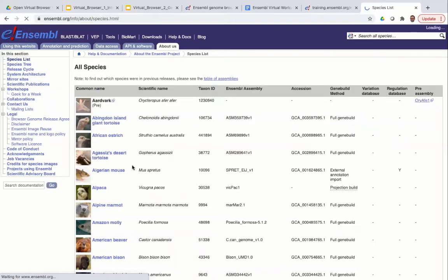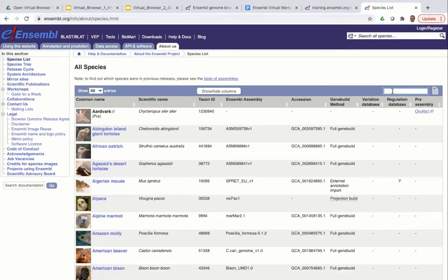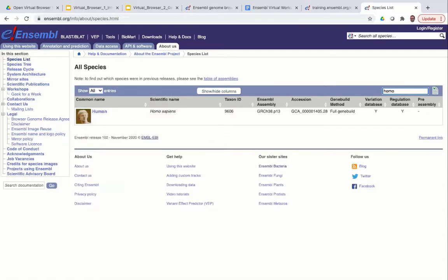This takes you to a table with information about all species in Ensembl. Looking at the African ostrich for example, you can see the common name, scientific name, taxon ID, assembly name and accession number. The accession number is the unique identifier for the genome assembly in the public archive where it was deposited. If you're using genome data from multiple databases or genome browsers, you can check that you're looking at the same data by comparing accession numbers. To find your species of interest, use the filter in the top right corner — for example, typing 'homo sapiens' to find human.